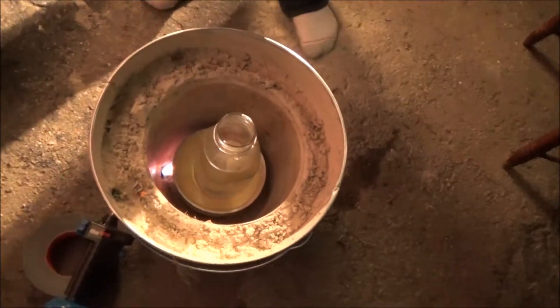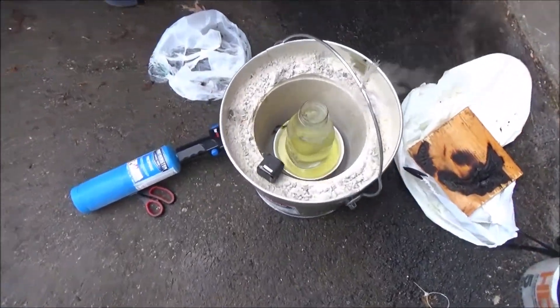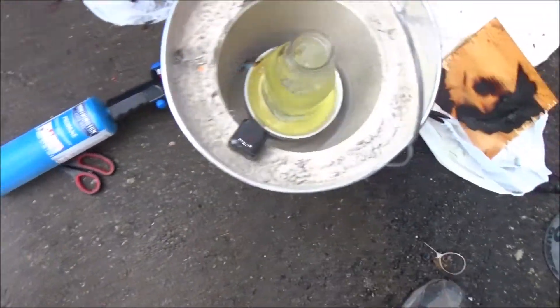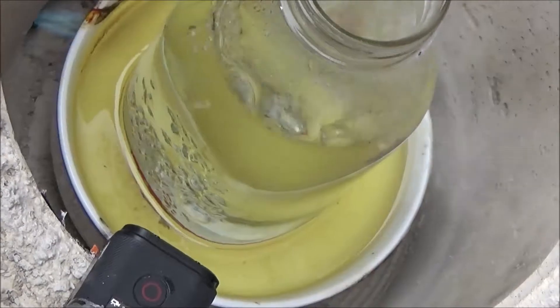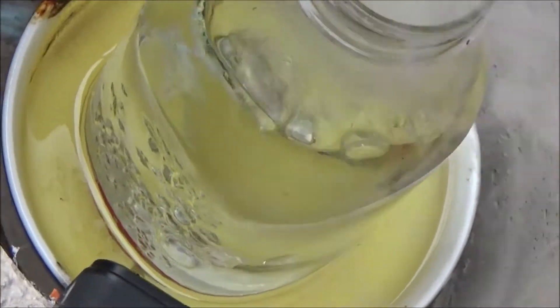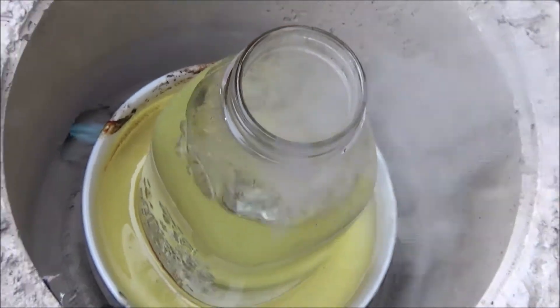This looks like it's working, so I'm going to turn it up now. Here is proof — I am now boiling the water off using an oil bath with my blowtorch in the bowl. This is actually working.